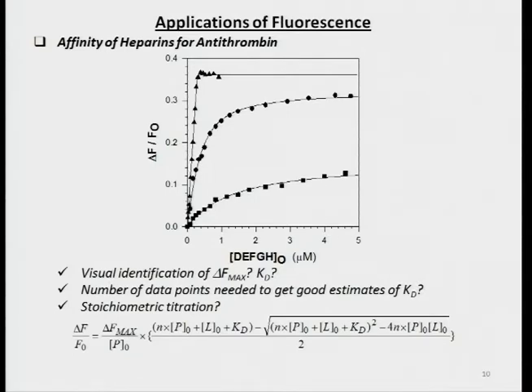The simplest way to think about it is that if you have a protein, and the probes that we had on the slide are aromatic probes, they bind in a site. In the free form, when there is water around, they have a different electrostatic environment, and when they bind the protein, they have a different electrostatic environment, right?